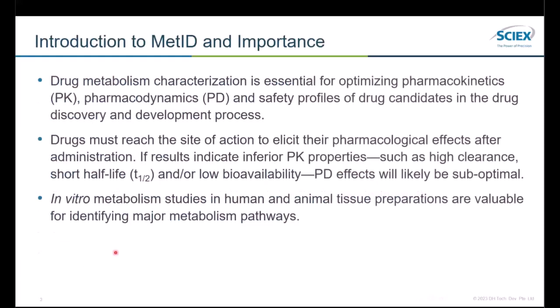So talking about MetID, right? MetID and its importance. We know that drug metabolism characterization is essential for optimizing pharmacokinetics and pharmacodynamics, and also the safety profiles of drug candidates in the drug discovery and development process. As we know, the drugs must reach the site of action to elicit their pharmacological effect after administration. And it's very important to have a stable drug, right?